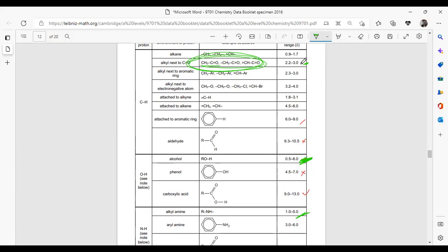A ketone does not have CH3 COO, and in the other portion there has to be a hydrogen, so a ketone cannot be in this case. This might also be an aldehyde, but so far it makes much more sense with that structure. We have a C double bond O group, and we have a COH, alcohol group.